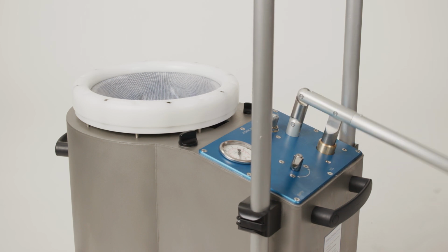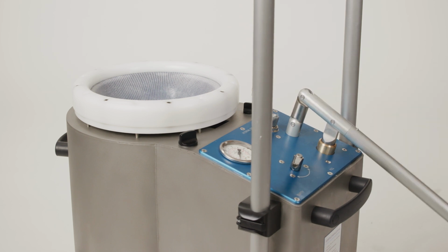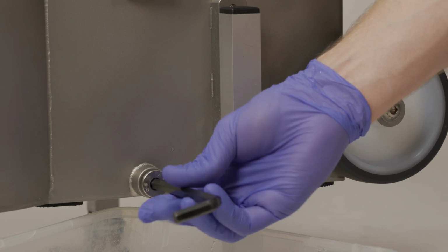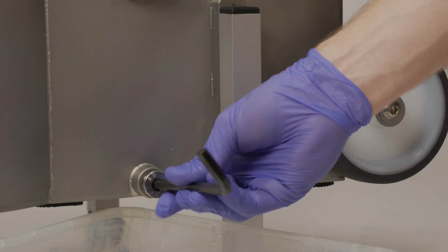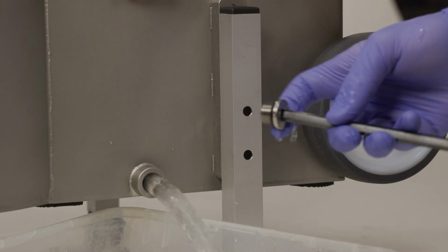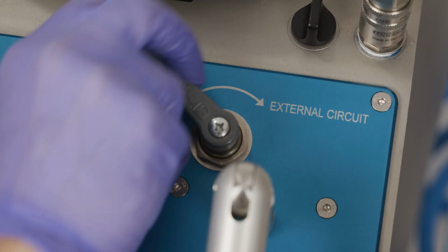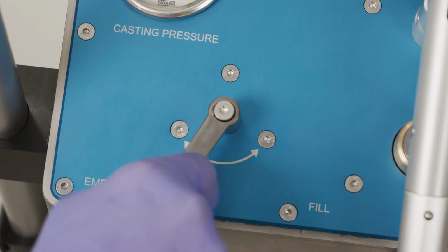Empty the inner tank completely and remove the height compensation components. Water can be released from the outer tank by means of the drain plug. Open the draining screw, and the tank will release almost all water from the outer tank. Alternatively, set the levers to external circuit and fill, and use the hose to pump out the water from the external tank.